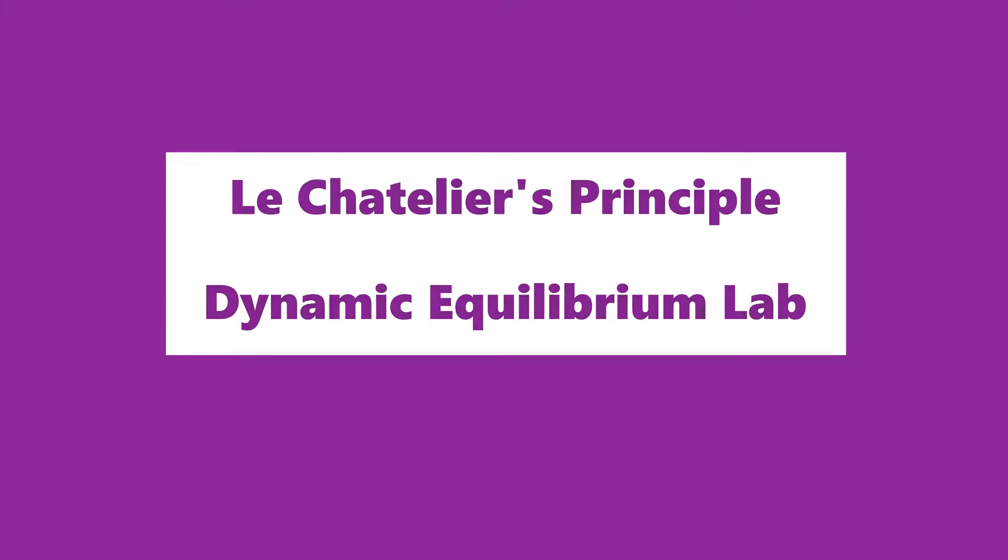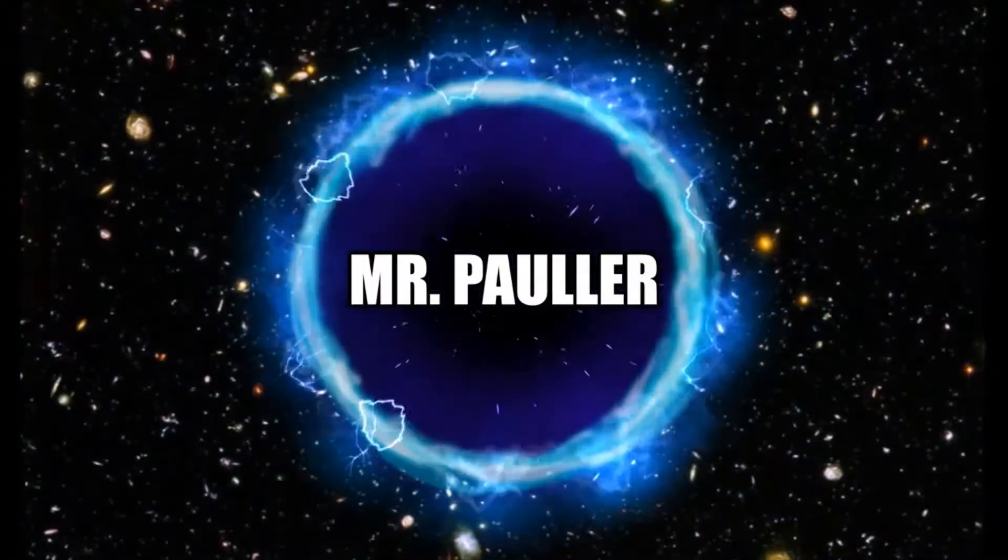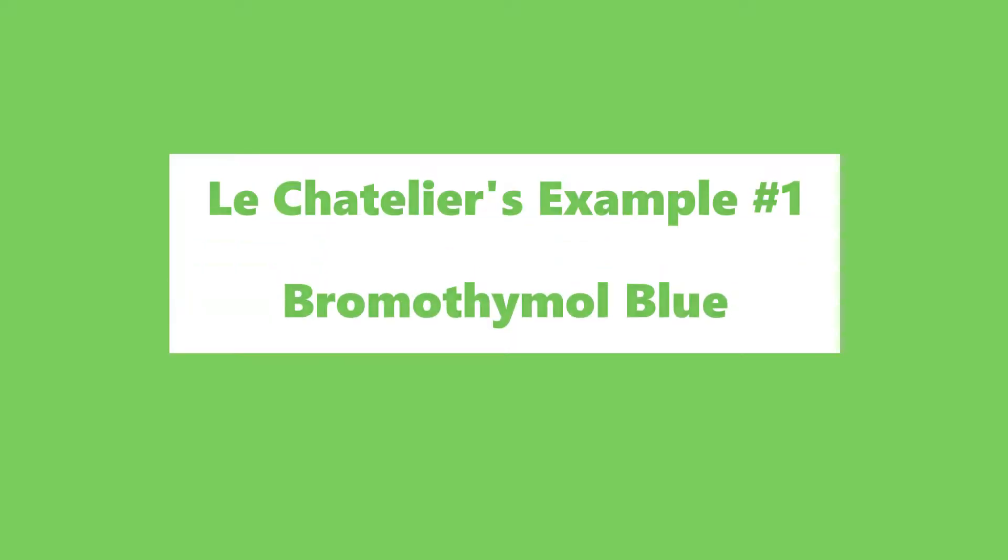This video shows an experiment exploring Le Chatelier's principle. The first example we'll look at uses bromothymol blue.